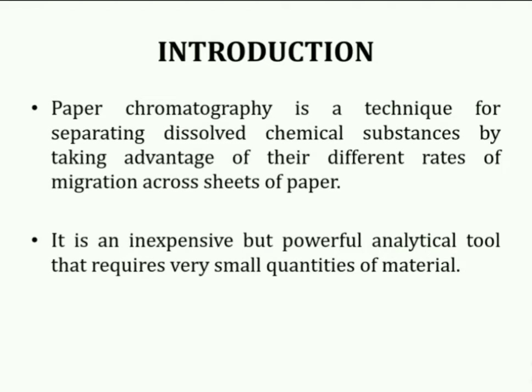In general, paper chromatography is a technique of analytical chemistry which is used for separating dissolved chemical substances by taking advantage of their different rates of migration across sheets of paper. Paper chromatography is an inexpensive but powerful analytical tool. Its main advantages include very little sample requirement.